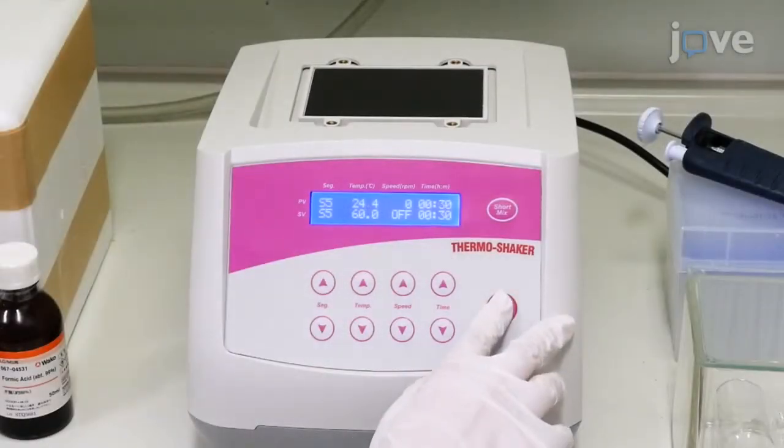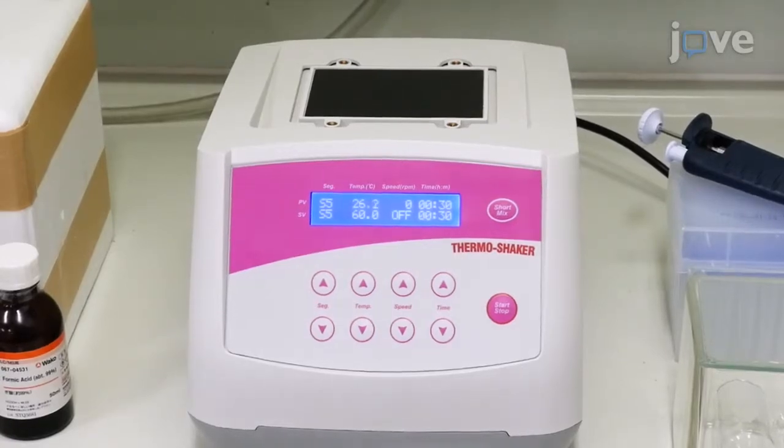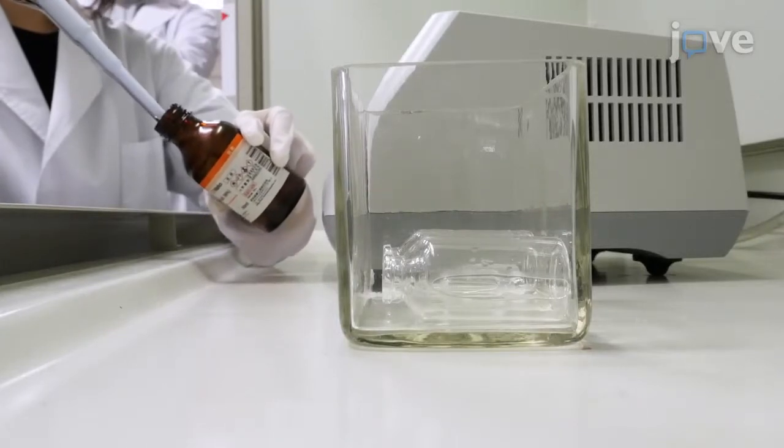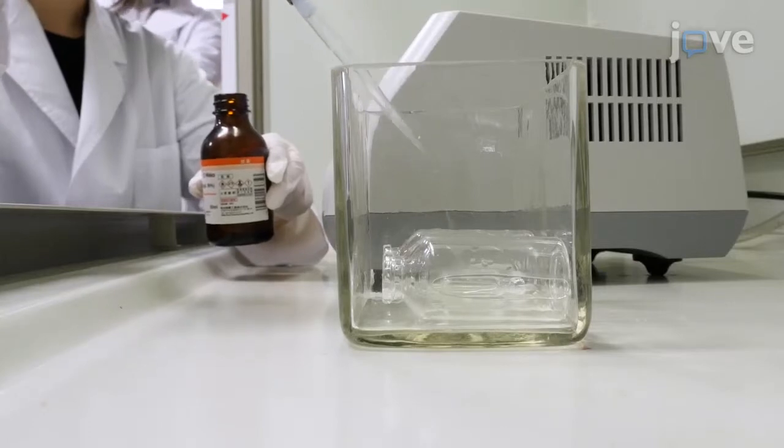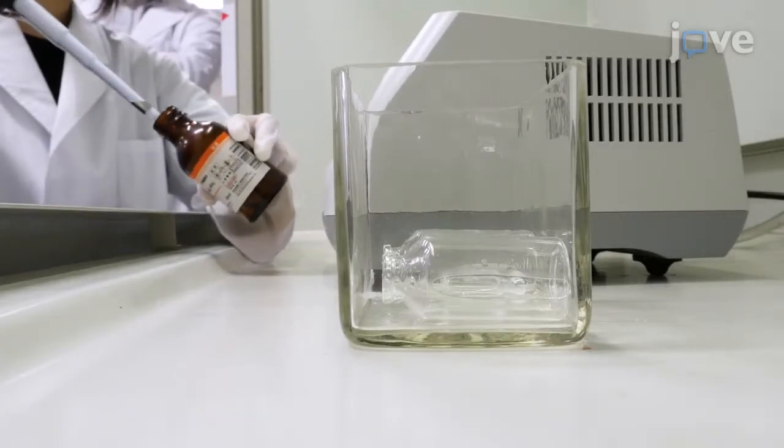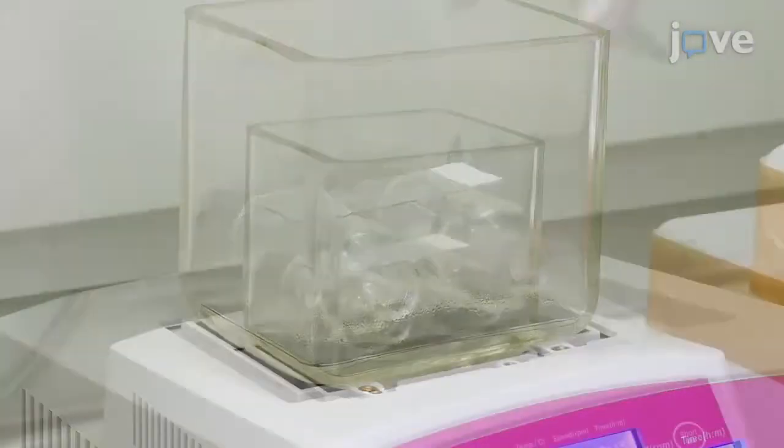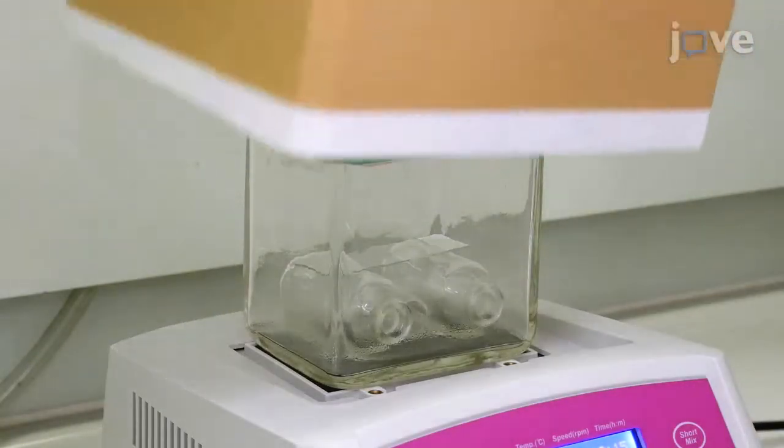Treat the tissue sections with formic acid vapor for better ionization of the amyloid beta proteins from autopsy brain tissue. To do so, prepare the oven at 60 degrees Celsius and an incubation glass dish with 5 milliliters of 100% formic acid. Keep the air humidity in the incubation glass dish at saturation level. Place the tissue slides in the incubation glass dish while avoiding submersion in the formic acid and treat for 6 minutes.